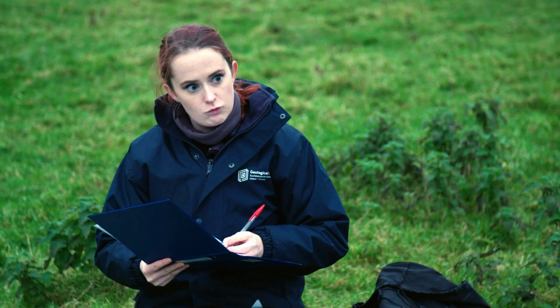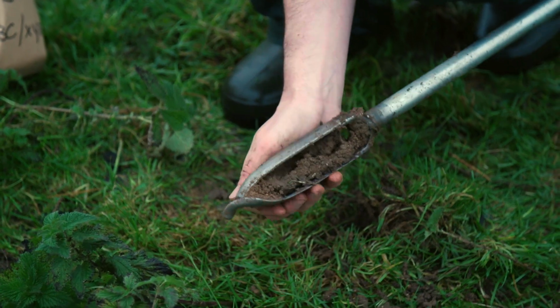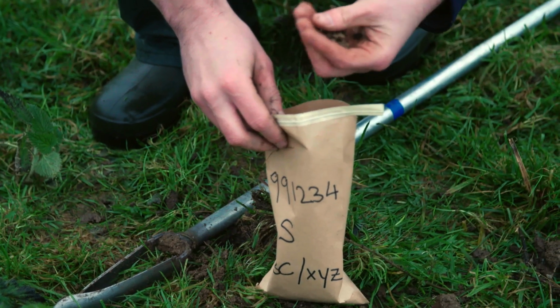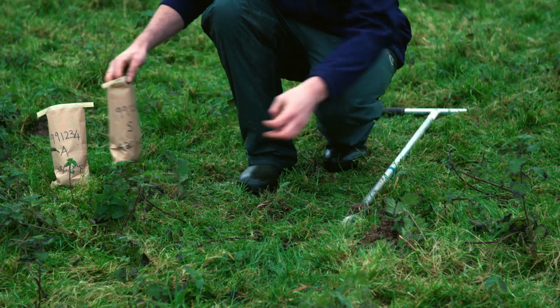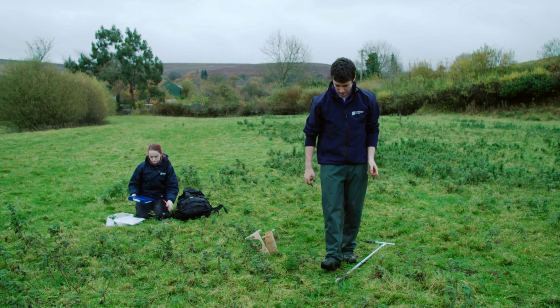About 40 centimeters deep. That's good. Place the soil sample material into the bag labelled S. Always make an effort to fill the hole after sampling.